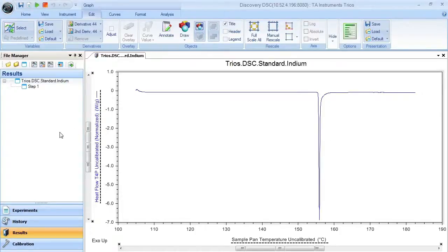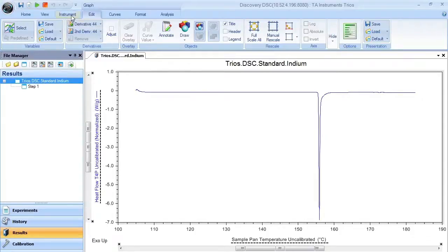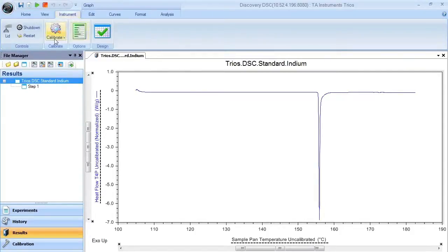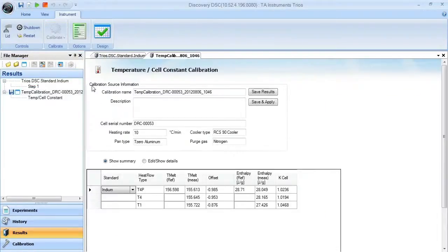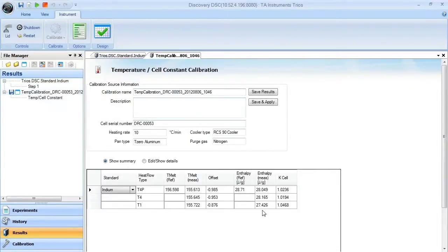At this point, you can select that run item, go to instrument, and the calibrate button should become active. If you select temperature cell constant, it will automatically go through the calibration and give you the output parameters from that analysis.